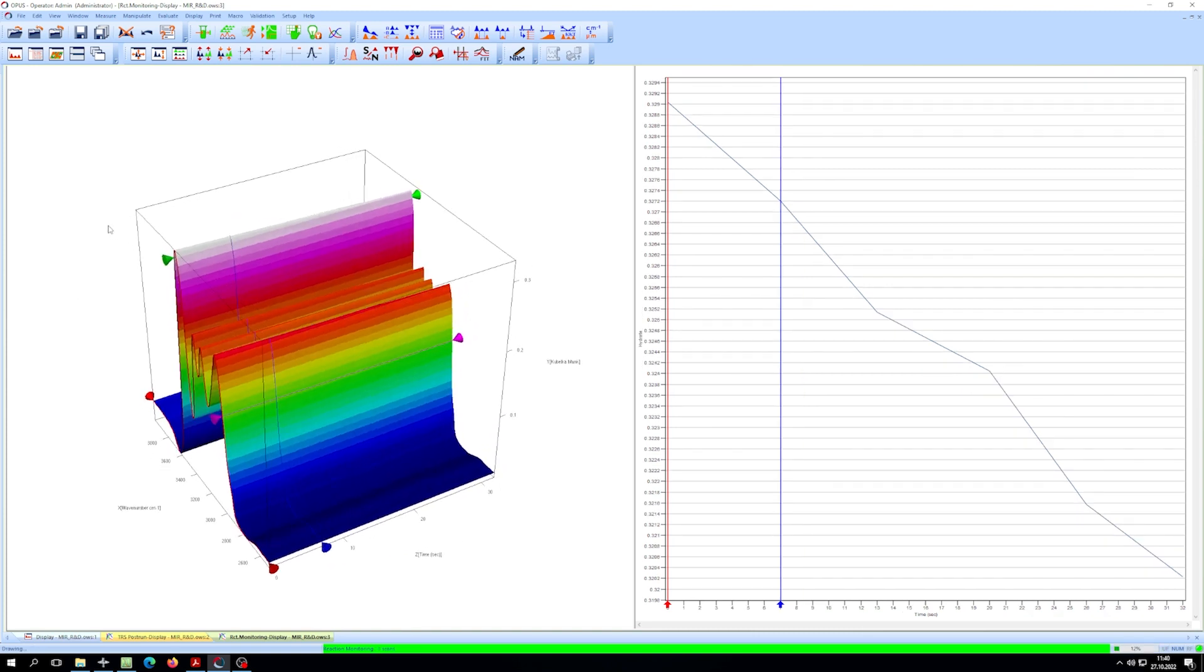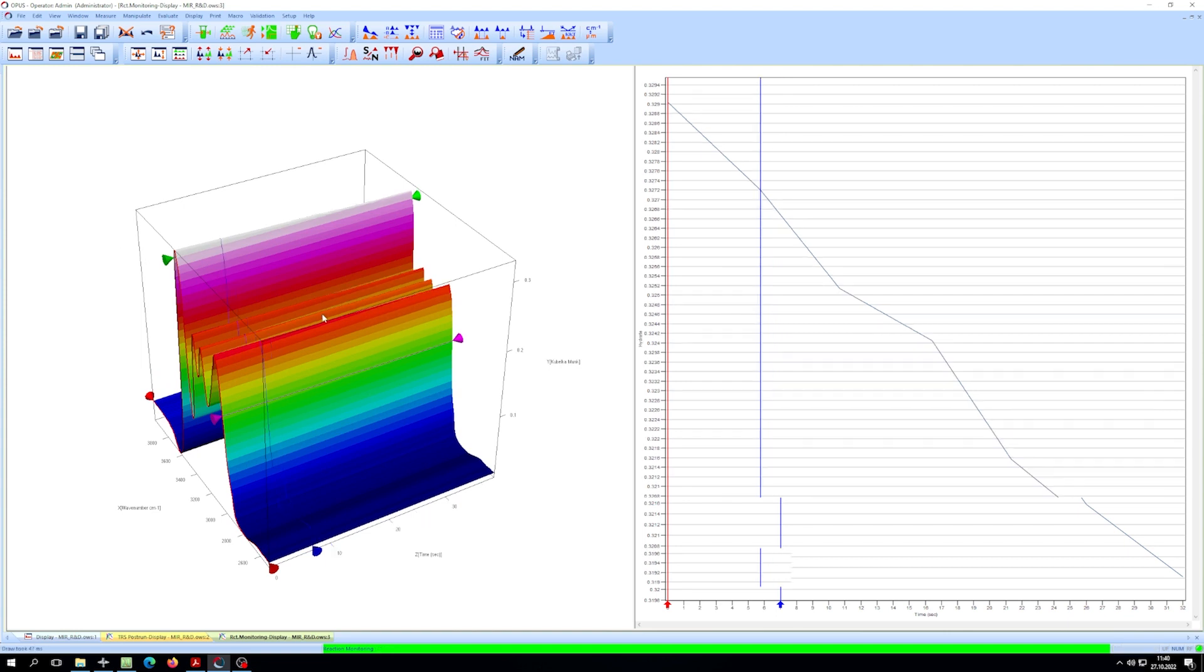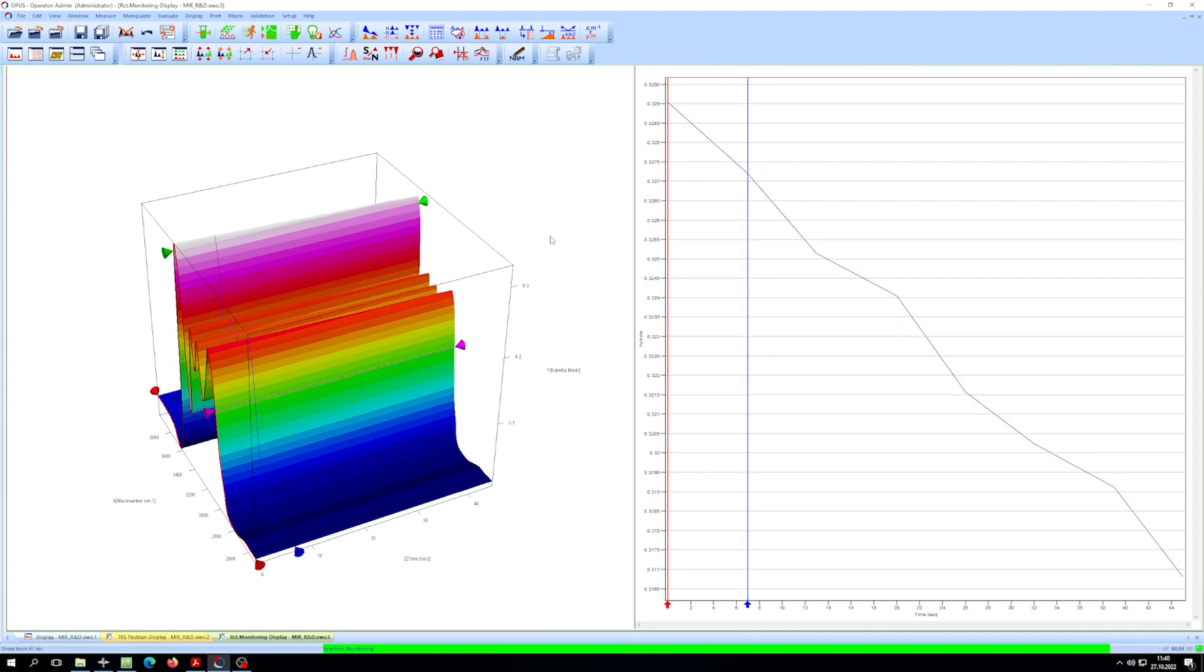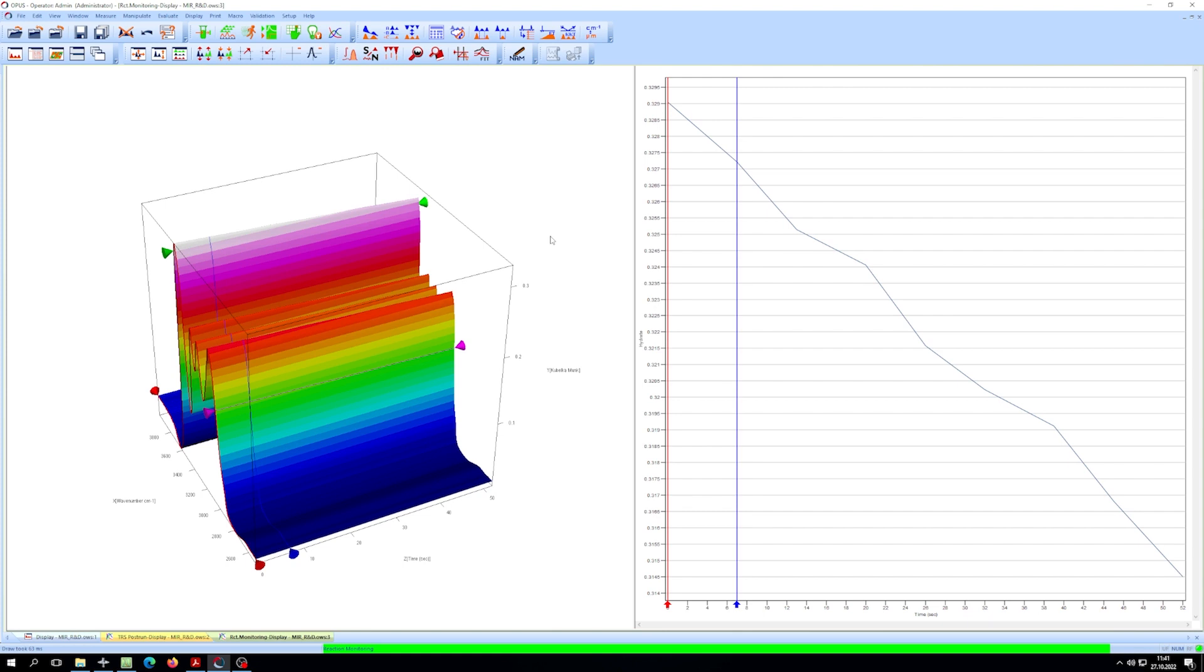For this, we have integrated the absorption signal of the OH bands over the wavenumber range shown on the left. The result of the integration is plotted against time, giving us a curve that tells us how far the outgassing process has progressed. The integration methods are configurable and can thus be adapted to various investigations.